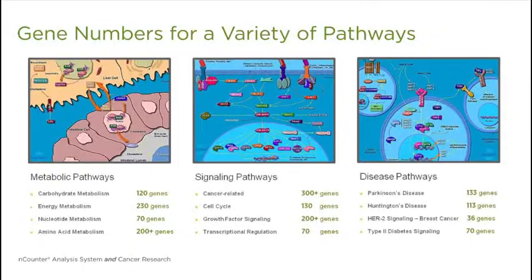There are a number of ways to study hundreds of genes at a time. Analog technologies such as microarrays and quantitative PCR don't offer the precision and the dynamic range that digital technologies such as next-generation sequencing do. Sequencing generates high-quality digital data, but it requires extensive sample preparation as well as bioinformatic resources. It can be cost and labor prohibitive to study even a moderate number of samples using this approach.